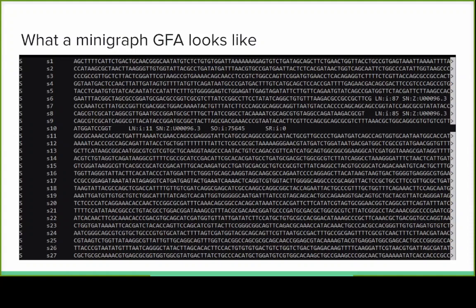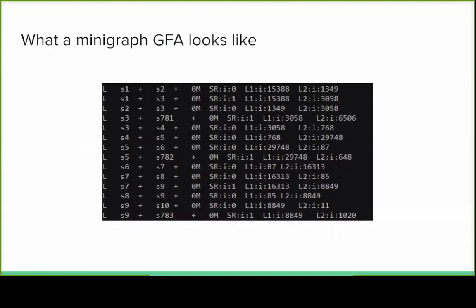The rank is basically zero for the original reference, and when you get a node from a later sequence, the rank is increased. Great, thanks. As you can tell, I'm not using minigraph so much. Links: same, no overlap. Annotation of 1 and 2, which I suppose correspond to the length of the input and output segments, and ranks.